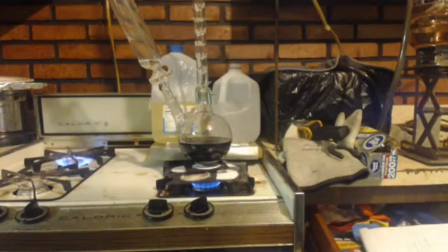And this bites me later on at the end of this video. You'll see that it actually solidifies because there's so much solid in there. But actually, it was no big deal because when I added the acid to quench it, it all broke up.